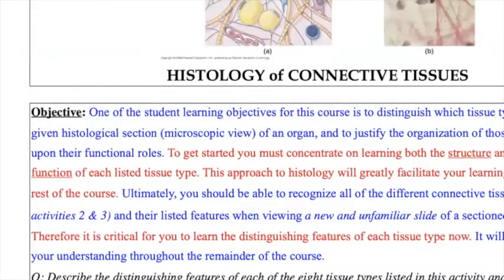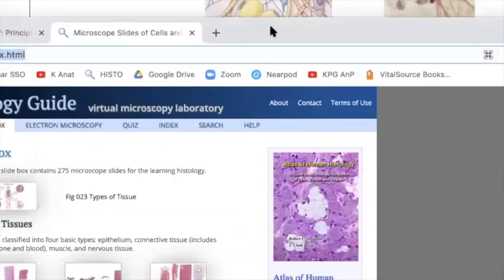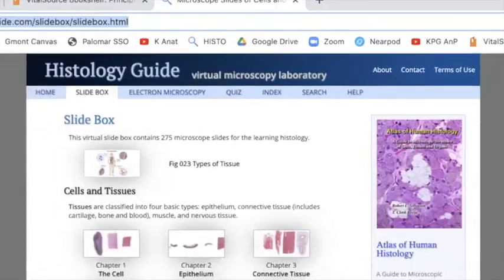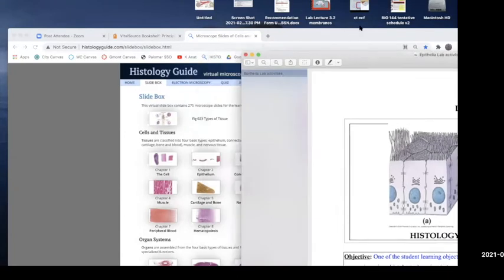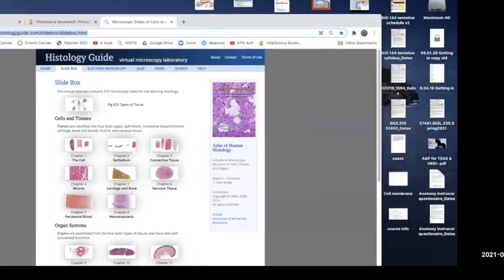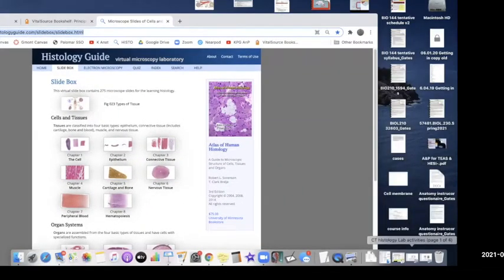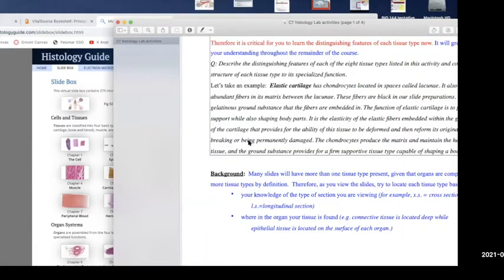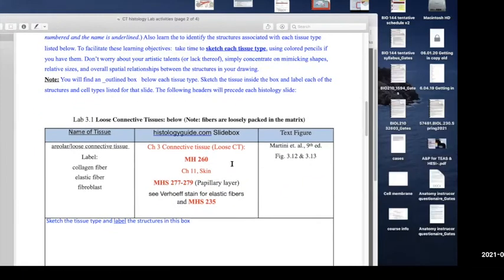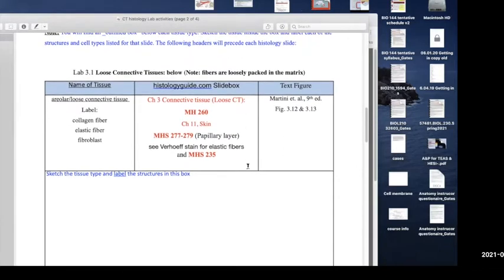So that I want you to identify, but these will come up over and over again. So we want to make sure that you're able to recognize. If you do them, then you'll do well on the practical. If you don't do them, you won't do well on the practical. Otherwise, it's self-guided, but if you're ever having a sticking point, then just bring it into class. The other thing I mentioned, you could always present them, like show, hey, am I doing this right? Am I labeling everything that's relevant? And I'll say, yeah, you're doing right, or yeah, you should do this or that. Take a different picture or something like that.